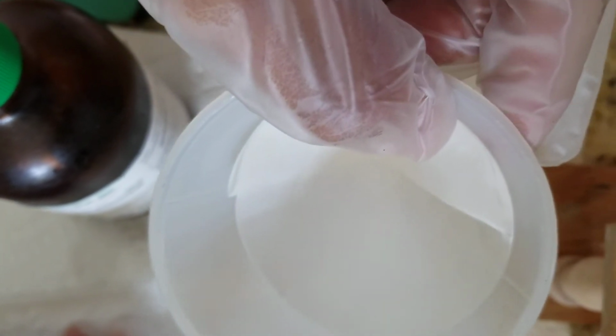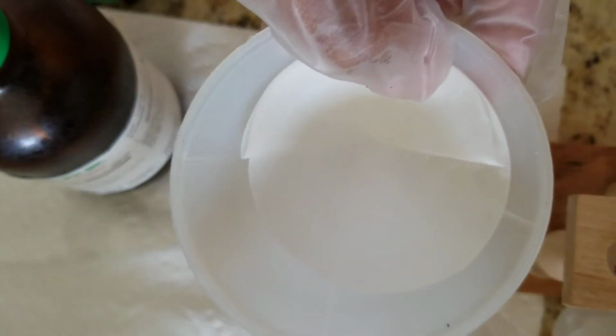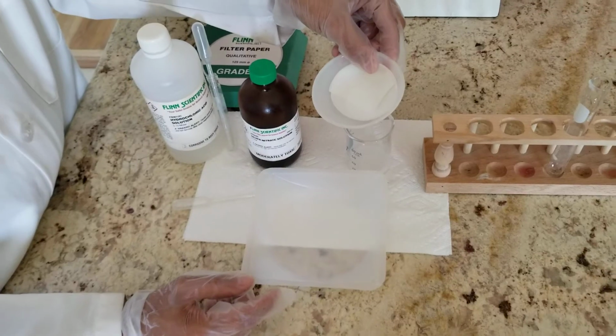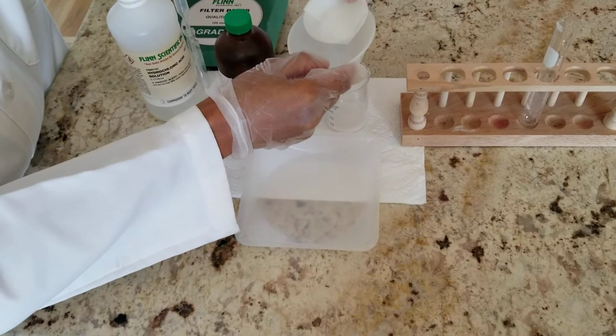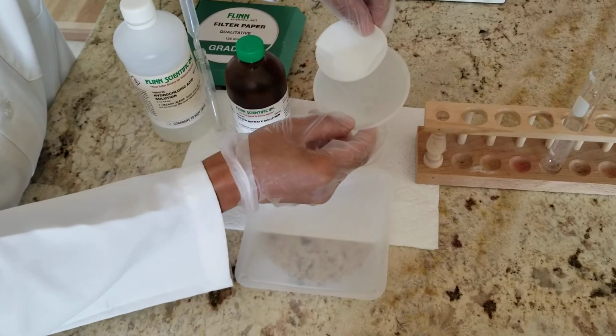It's hard to see on camera, but I can see some white, powdery material trapped on the filter paper. Let me see if I can uncover the filter paper a little bit more just to allow this process to go quicker. Yeah, as long as I don't break it, we should be fine. Okay, we're at a point where I think we have enough of our filtrate to run through. I'm going to open it and set it on our container here. We're using a weighboat; if we had a bigger watch glass, we could have used that as well. All right, so now let me set this down. Let me open this up.